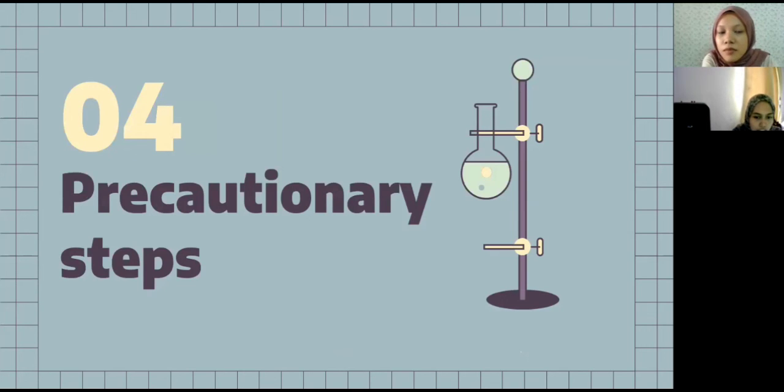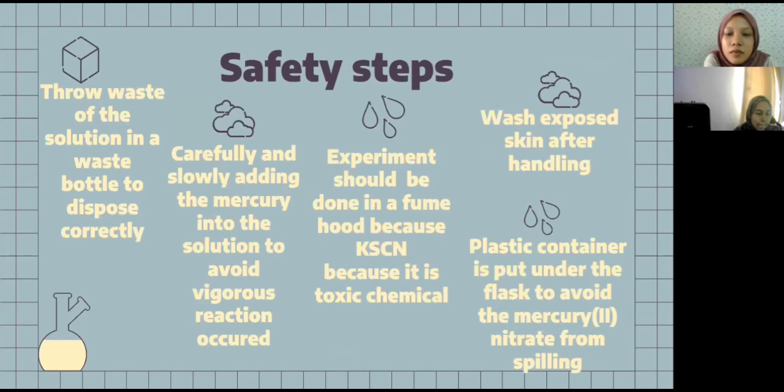Alright, the last one is the precaution step. Next.